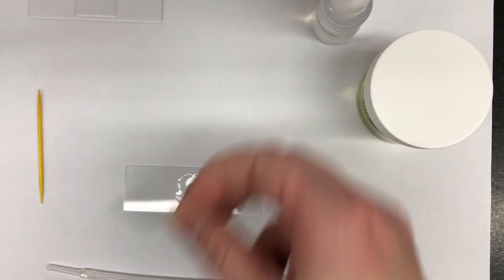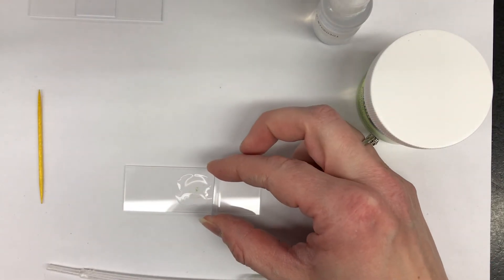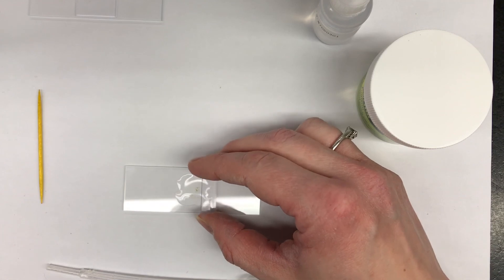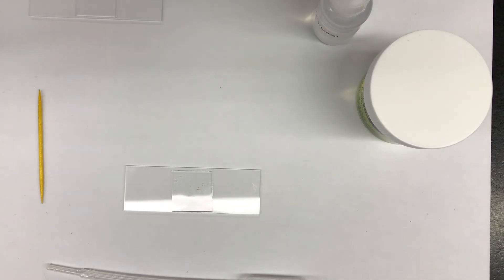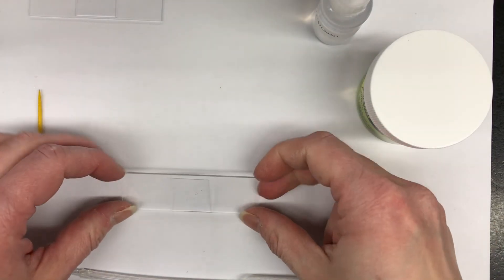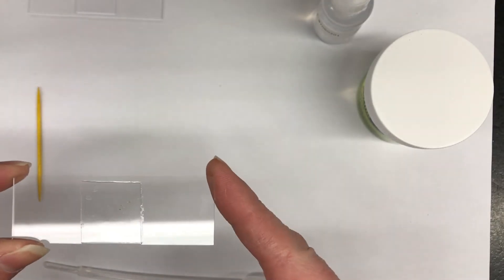You're going to pick up your cover slip, rest it on the slide, and then slowly lower it down onto your sample. And there you have it, a wet mount slide for euglena.